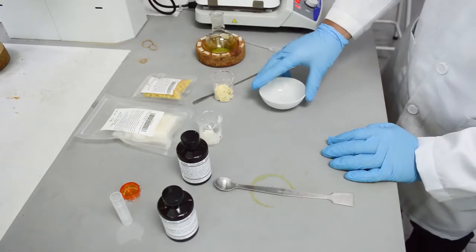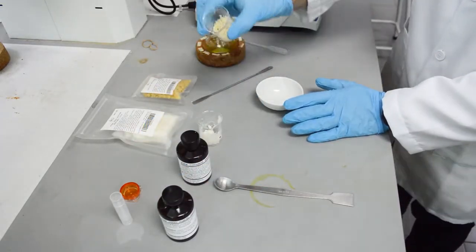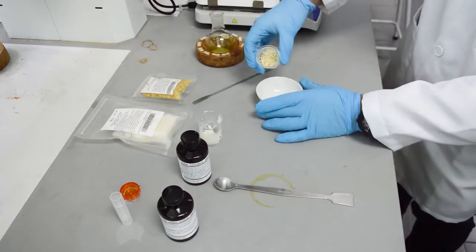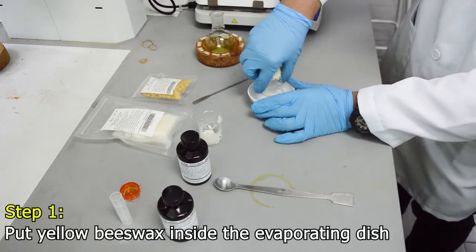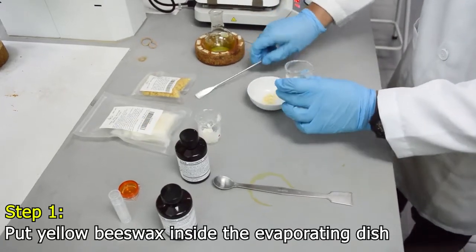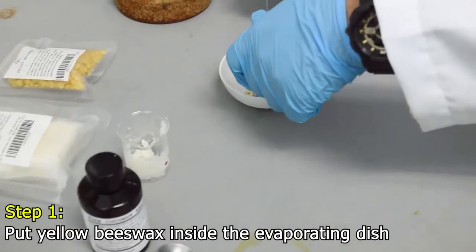Now all the ingredients are ready, packed here on this bench. This is the yellow beeswax — I will put it inside the evaporating dish. We scrape all the yellow beeswax into this evaporating dish.